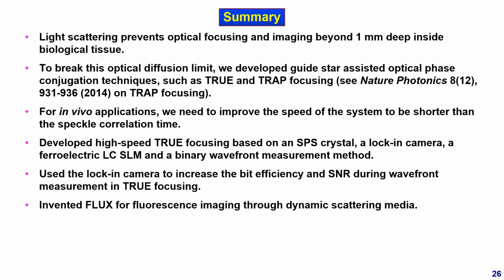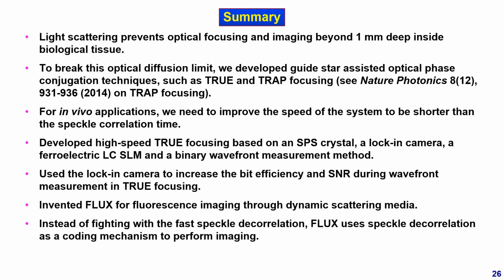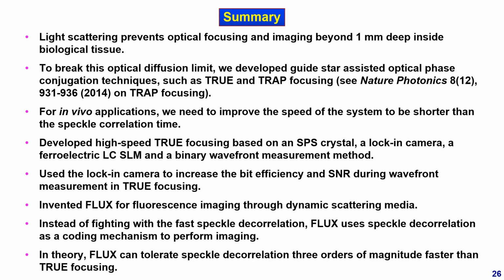We invented flux for fluorescence imaging through dynamic scattering media. Instead of fighting with the fast speckle decorrelation, flux uses speckle decorrelation as a coding mechanism to perform imaging. In theory, flux can tolerate speckle decorrelation 3 orders of magnitude faster than TRUE focusing.